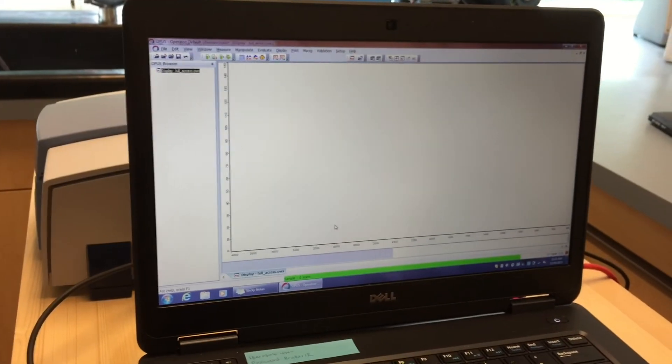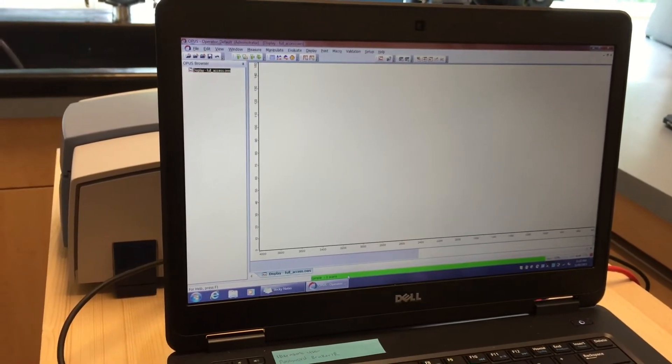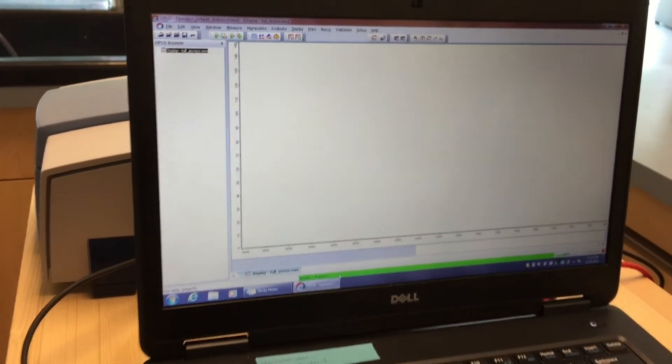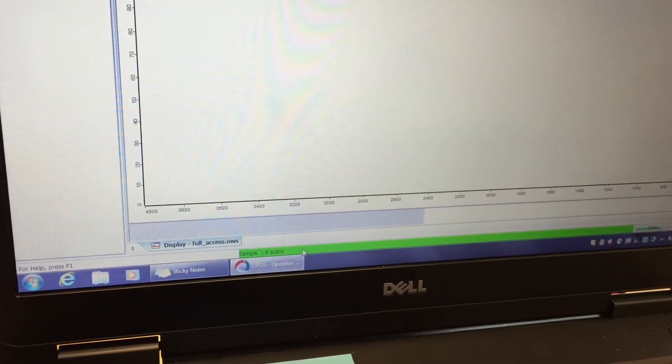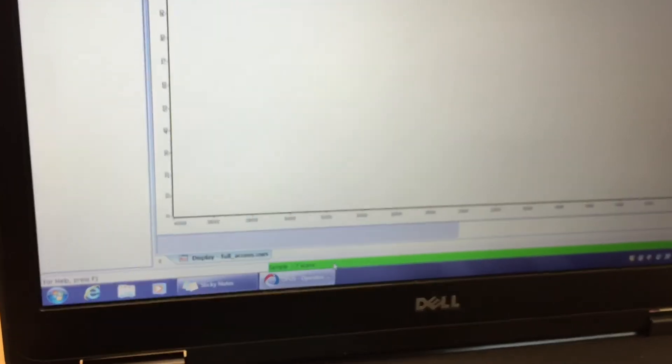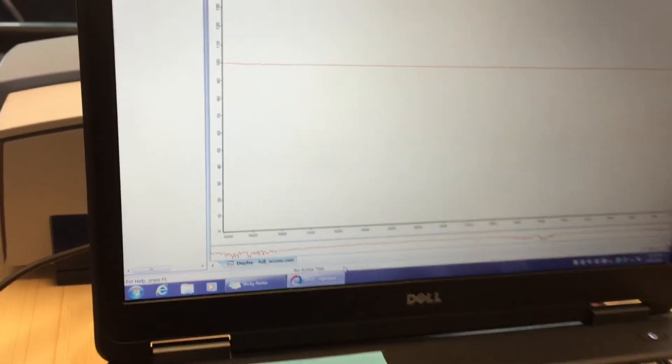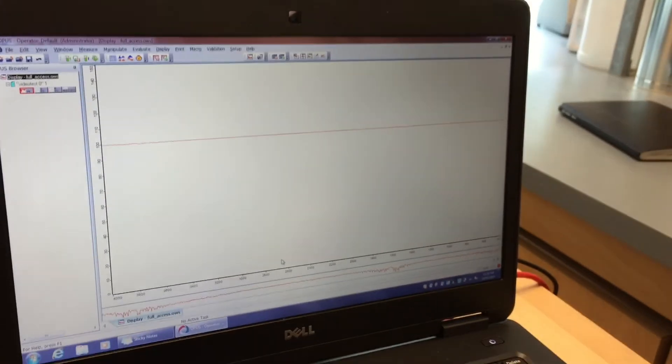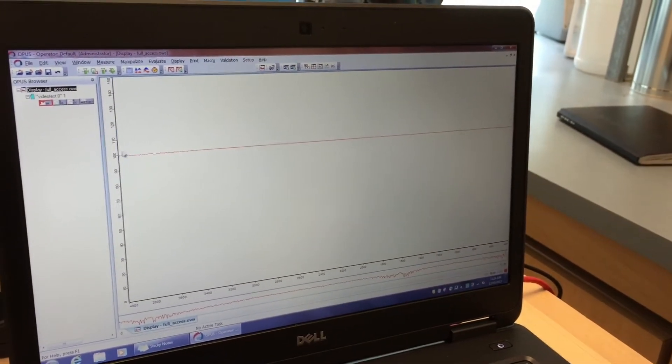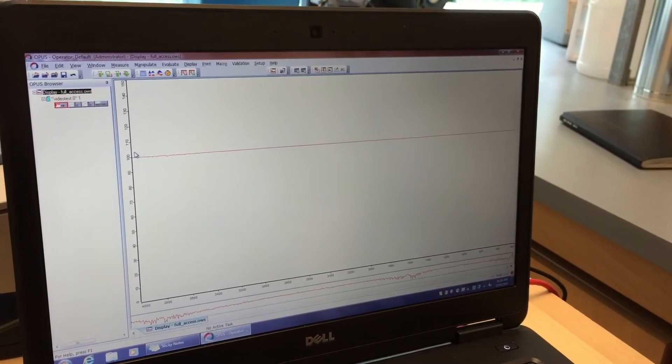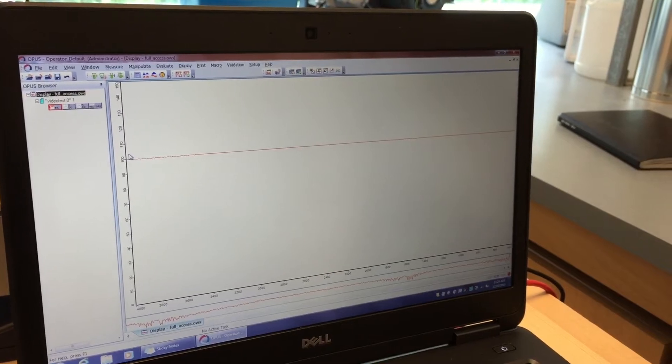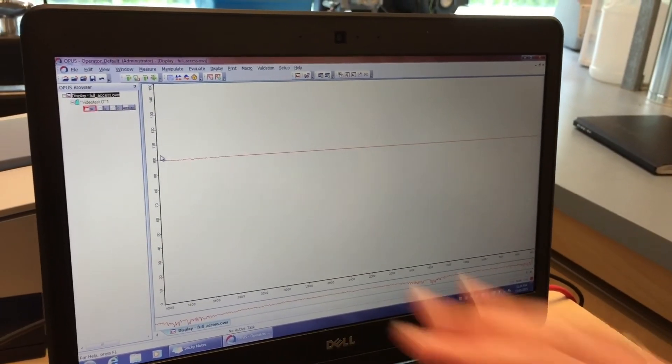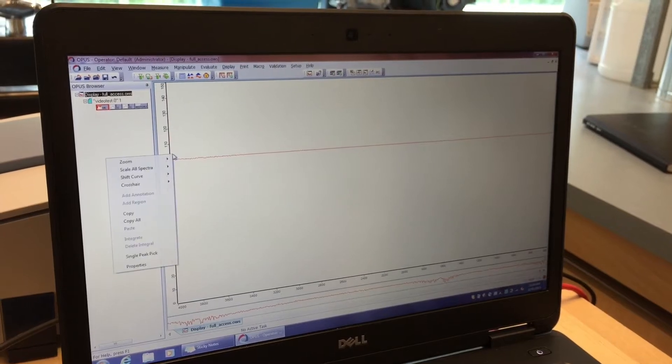Now we're going to hit sample single channel on here. This is the button right there. It's again telling you down here in the green bar how many scans it has done. This is what shows up. We took a spectrum of the same thing that we did the background of. The background got subtracted, so it makes sense that it's pretty much a straight line.